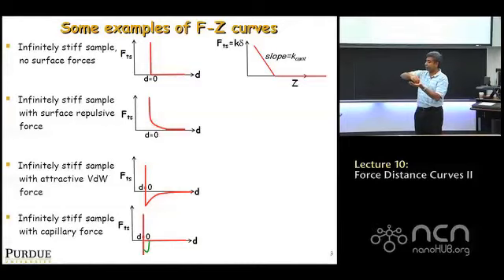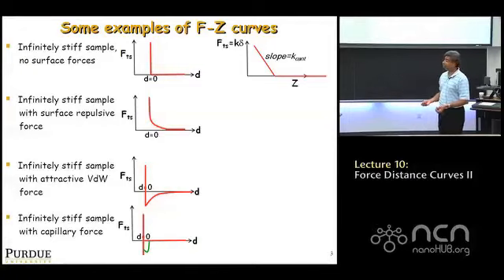what you expect to see is the bending: the cantilever tip moves with respect to the base as much as you push down. So if Z goes down a certain amount, the tip relative to the base goes up by the same amount. So this is initial contact, and then I press Z down, let's say 10 nanometers. Well, the tip relative to the base of the cantilever goes up by 10. So what we measure in an AFM experiment is we change Z. Z can keep changing, up and down, but D remains 0 all along.